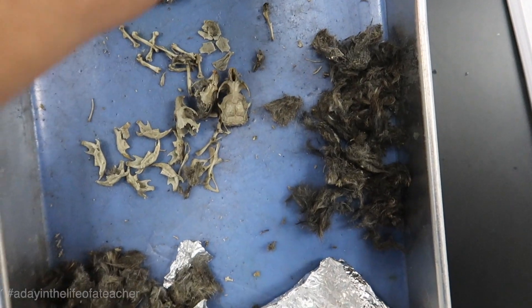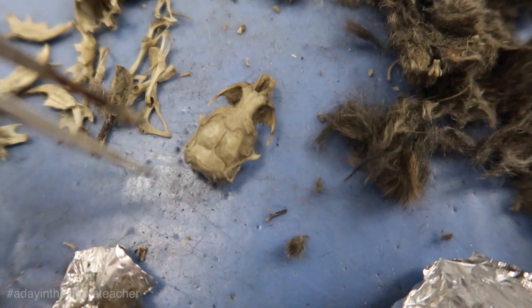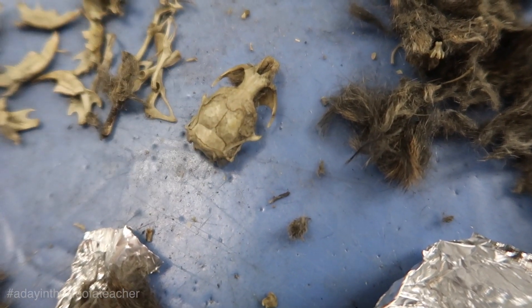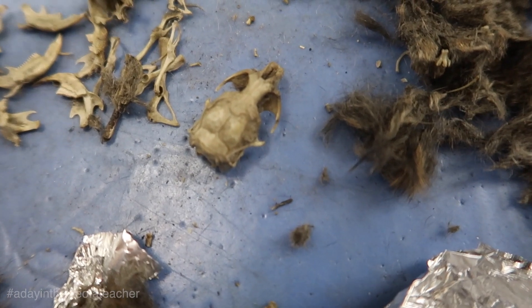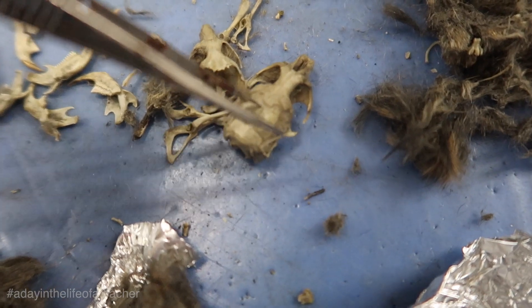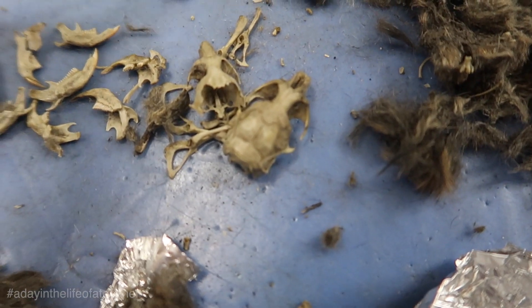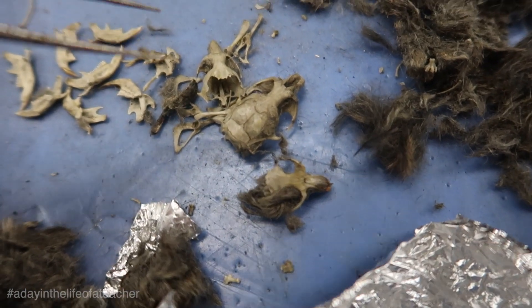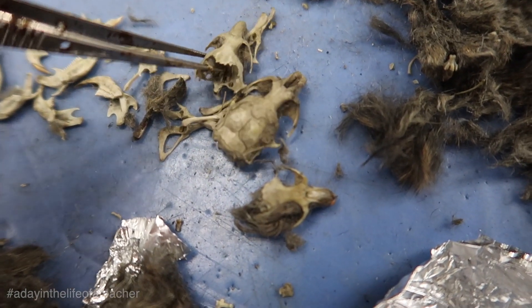I kept one pellet result to show you all what it looks like. Out of all my years teaching, I've never seen a skull still intact. Just as a comparison, this is what most skulls look like — you can see how the cranial system is all broken here. One cool thing about owl pellets: owls throw these up about every six hours of the day.